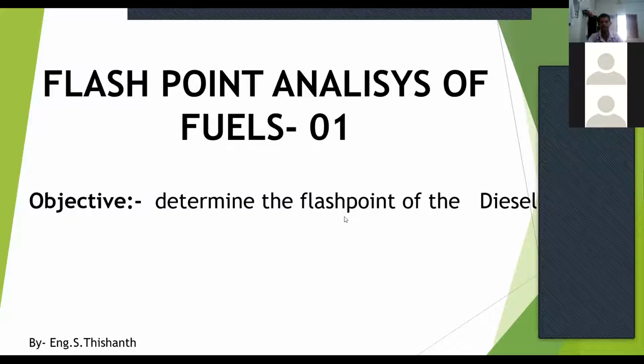So the objective of this session is to find or determine the flash point of the diesel fuel. That is our objective for today's session. Let's go and see what flash point is.